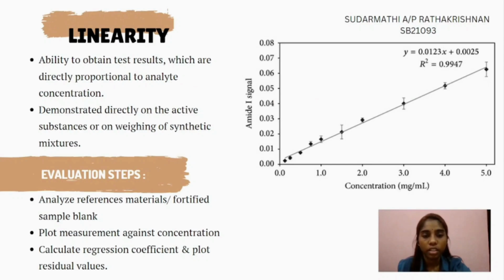Linearity is the ability to obtain test results that are directly proportional to analyte concentration within a given range. It may be demonstrated directly on the active substances or on weighed synthetic mixtures. To evaluate linearity, we have to analyze the reference materials, plot a graph of measurements against concentration, then calculate the regression coefficient and plot the residual values.